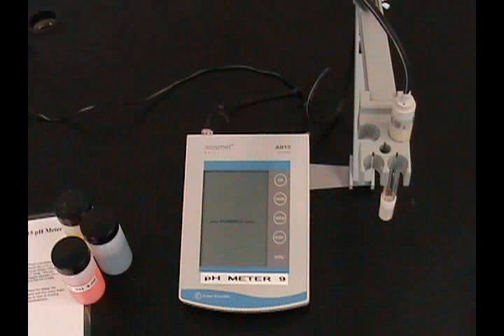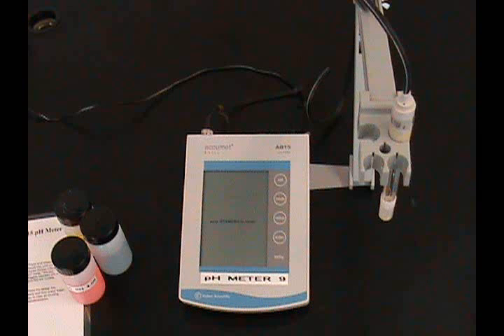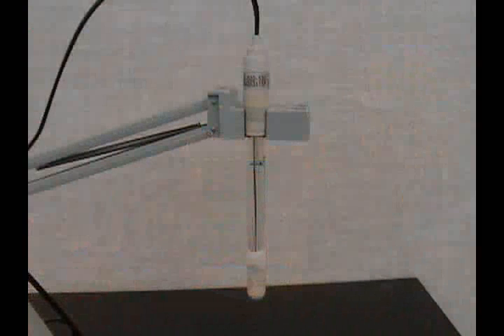The pH meter is used to measure the acidity or alkalinity of a liquid through a probe by reading the activity of hydrogen ions.